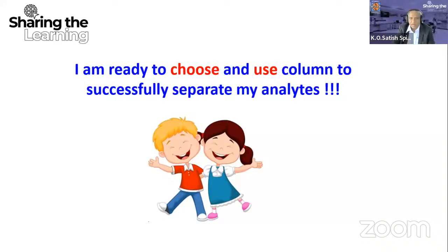So what is the shelf life of a column? This is a query from Mr. Muthu Ramaling. You can spoil a column by 1 injection, or you can use a column even for 1000 injections. If you take care of your column, normally a column will last around 500 to 600 injections.